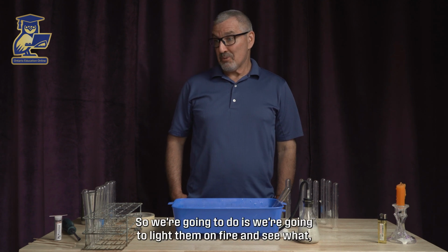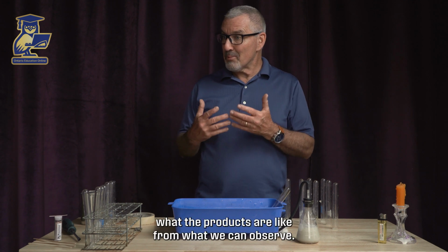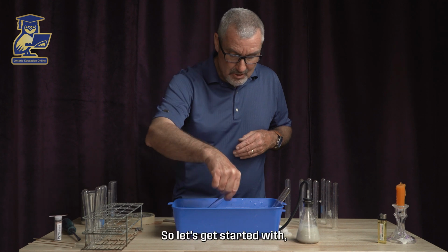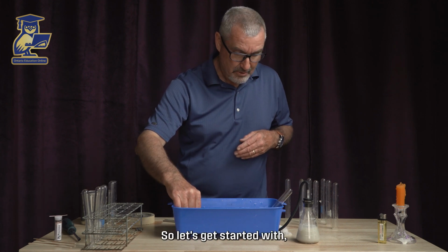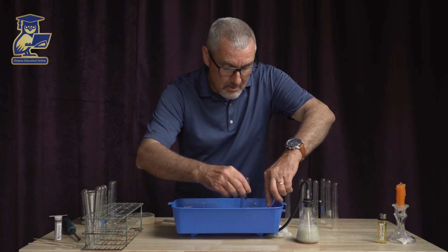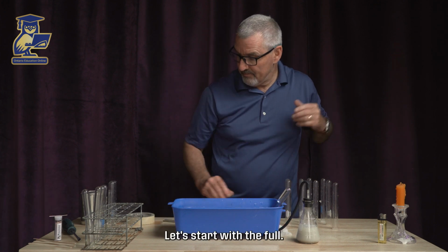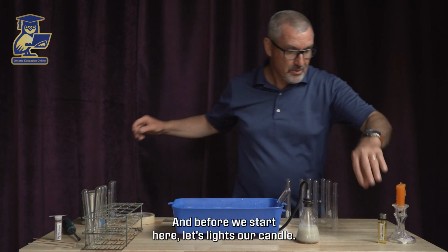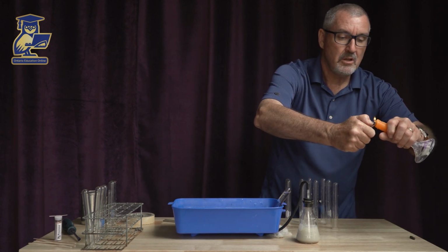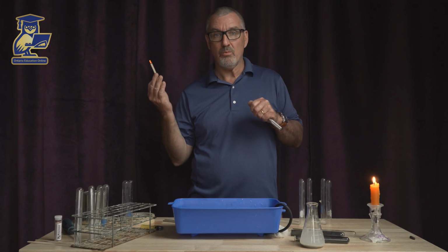So we're going to light them on fire and see what the products are, from what we can observe. Let's get started with the first one. Let's start with the full. And before we start, let's light our candle. This is the ethyne full, no air, 100% ethyne.